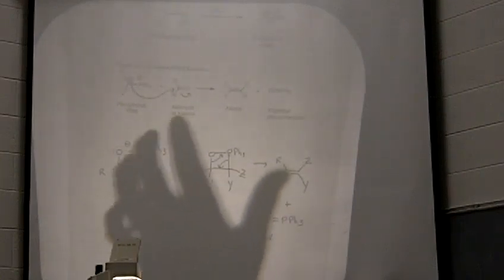And like I said, you'll go into more detail with this when you cover it in lecture, but this is kind of the basics of the reaction, so you have an idea of what's going on, all right? And if you want to look in McMurry for more information, page 720 of the 7th edition talks about it. So for our particular reaction, we've got this triphenylphosphonium salt, which, if you look in your lab manual, has a long name, okay? So we'll know it as our triphenylphosphonium salt, okay? And it's a bromide salt.